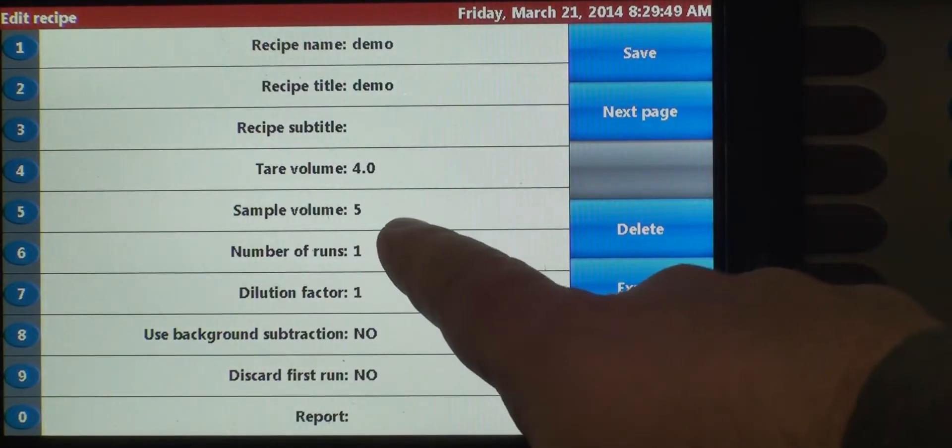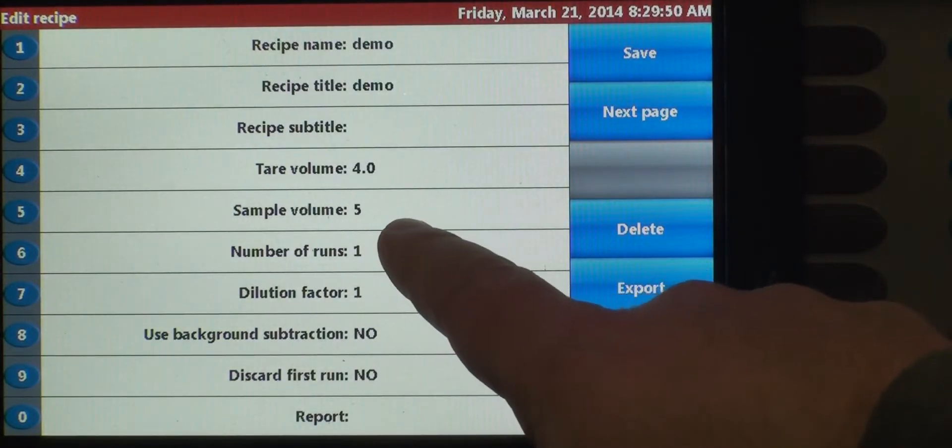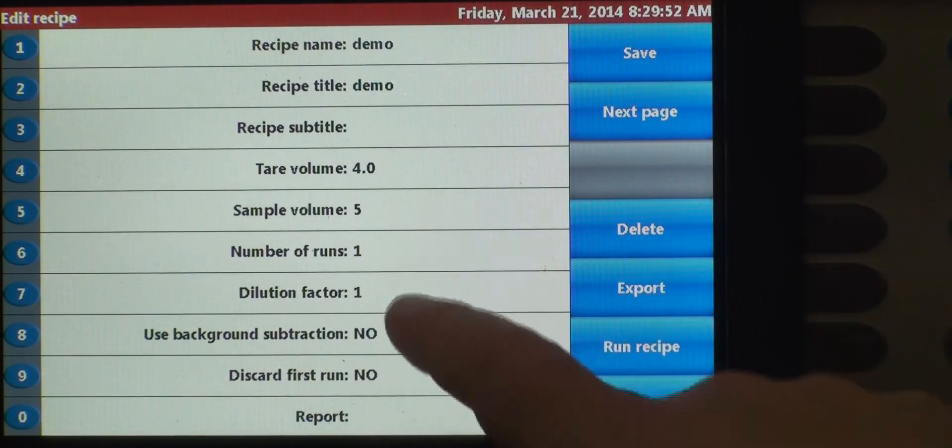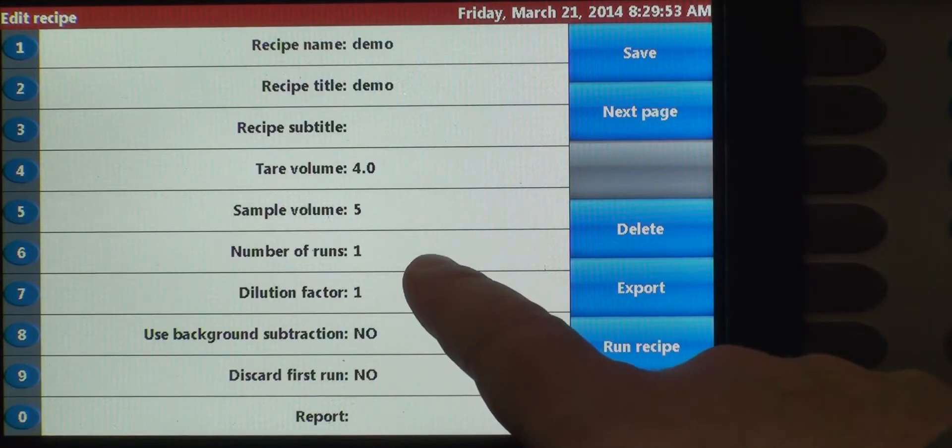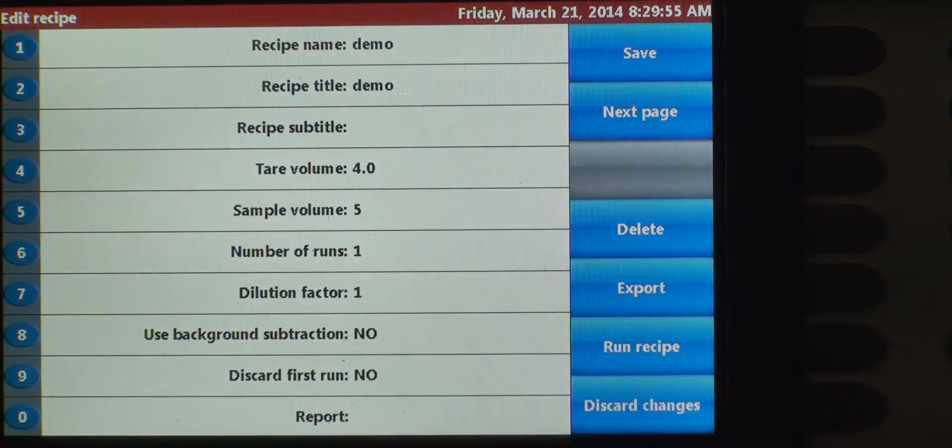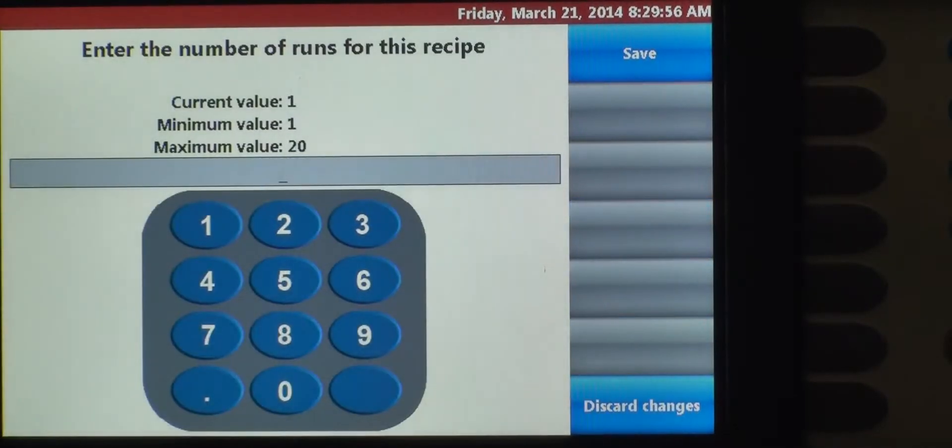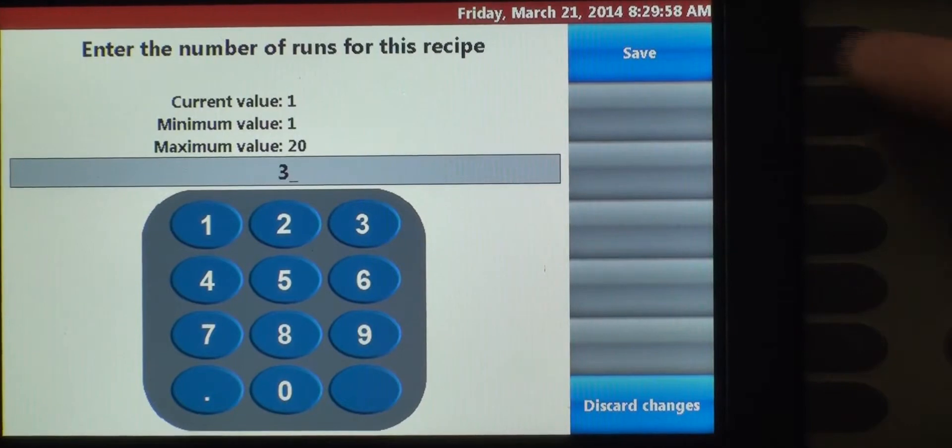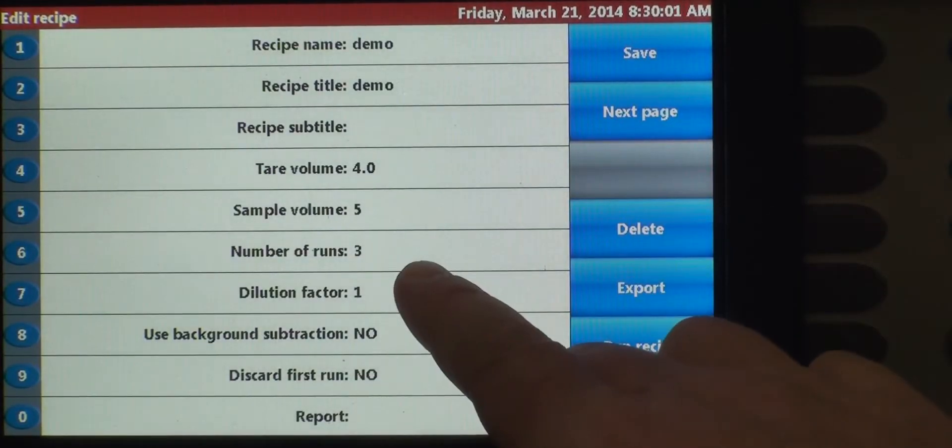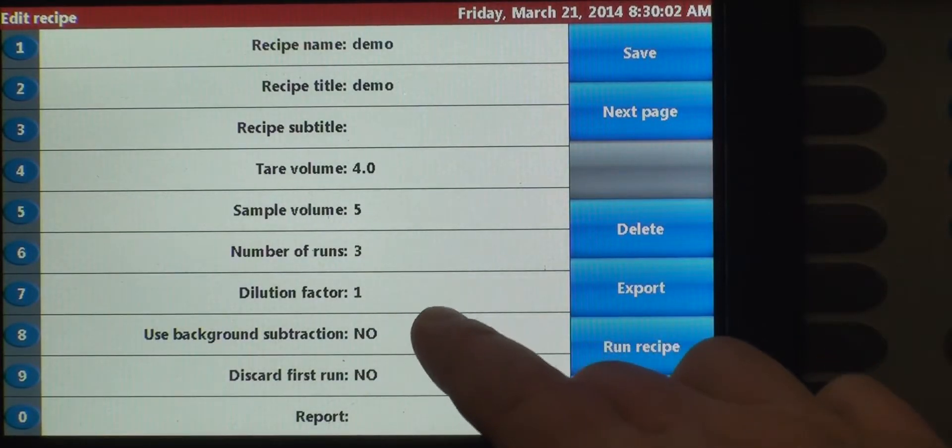The sample volume that we're going to run is five mils. That's the default. We're going to do three runs instead of one. So we'll change that. Save it. So back up to three runs.